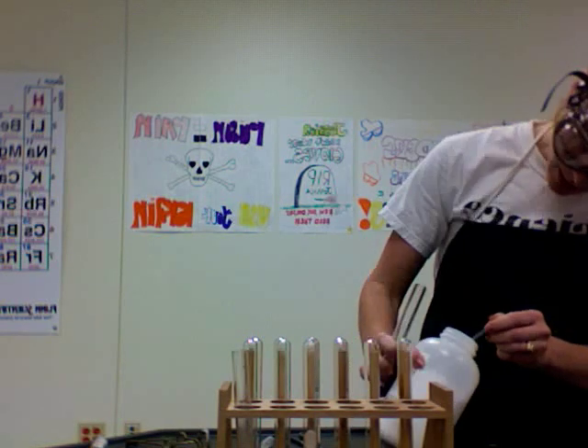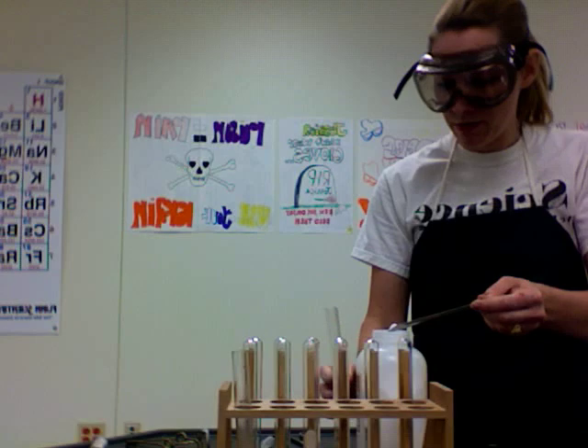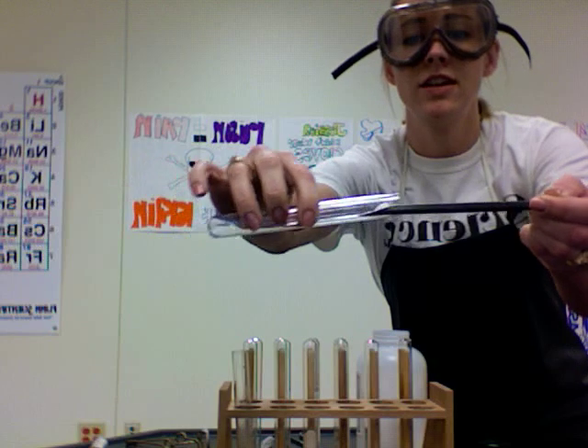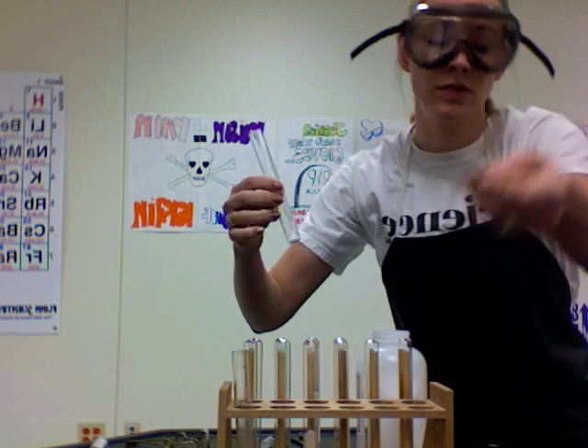Experiment number three is the decomposition of ammonium carbonate. Proper solid transfer technique: load your solid up on the spatula, slide your test tube over the spatula and then just tilt it up — and you don't spill any. That's why the spatula is shaped like this.